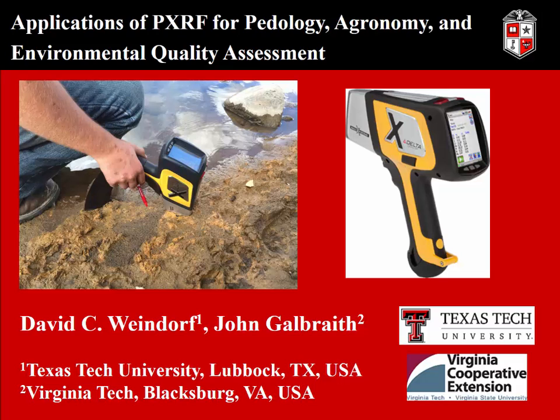So, portable X-ray fluorescence is an instrument, a proximal sensor, and it's really come to define much of my research career over the last decade or so. As John has mentioned, I've published dozens of papers on this in journals all over the world, and we've done research with this instrument all over the world in all kinds of different applications. So I want to talk with you this morning about some of those applications and some of the findings and maybe get you brainstorming as to some ways that you could use this technology as well.